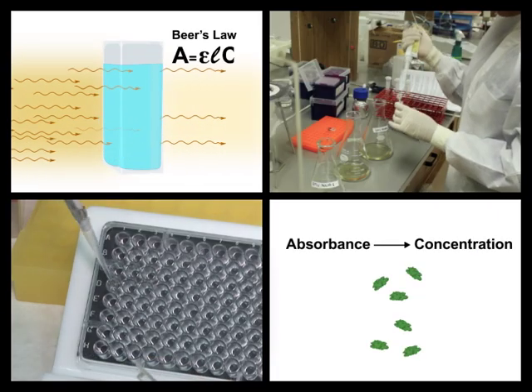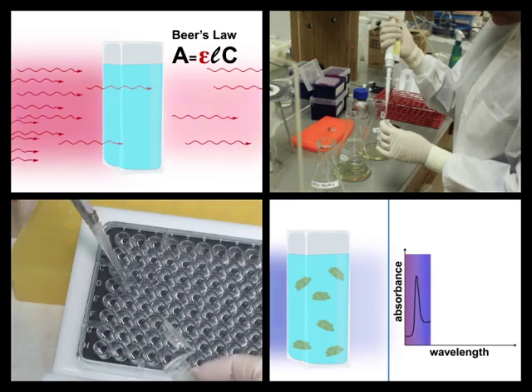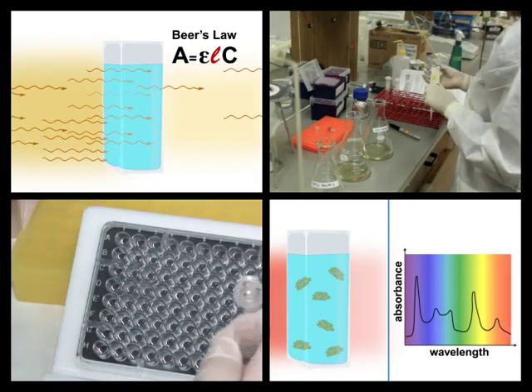You've just watched JoVE's introduction to UV-visible spectroscopy. You should now understand the basics of UV-Vis operation, how to measure a sample using a UV-Vis, and how to correlate absorbance to sample concentration.